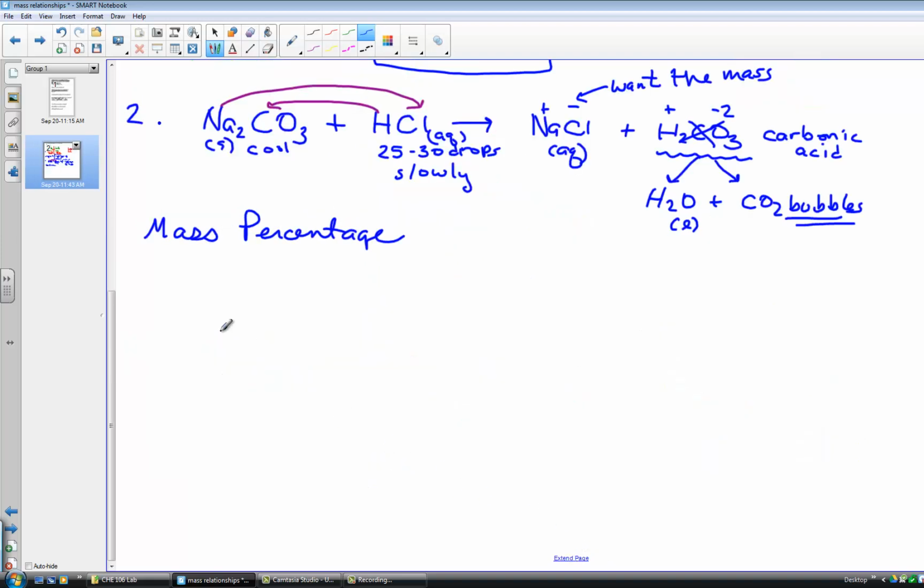Alrighty. So let's first of all talk about a theoretical percentage by mass. Let's just take, maybe we'll start with that NaHCO3, the sodium bicarbonate salt. And this would be unknown 1, 2, 3, or 4. It could be any of those 4. But it definitely will undergo a decomposition followed by a double replacement. And at the end, you'd have sodium chloride. After the addition of acid, you produce sodium chloride.